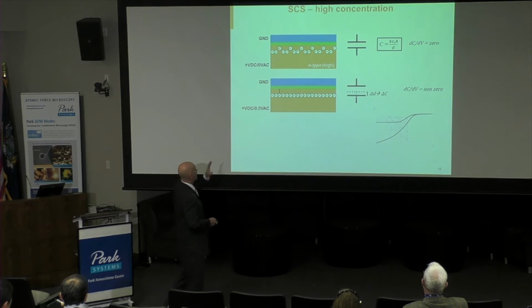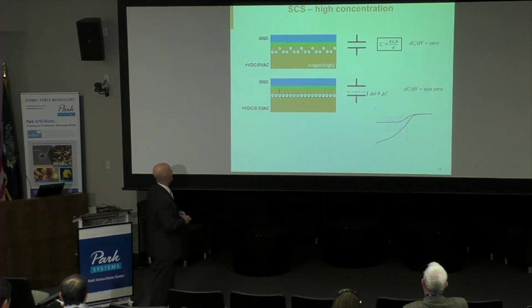In spectroscopy, what we do is we take it through a whole series of different bias conditions to look at low doped areas, because if we flip this around, we can force low doped areas into accumulation. That's the converse of this. So that enables us, by using a series of different bias conditions, to start to pull data out where we've got really low doped silicon or very heavily doped silicon where we otherwise would not be able to get a signal. So that's essentially what we're doing with scanning capacitance spectroscopy.